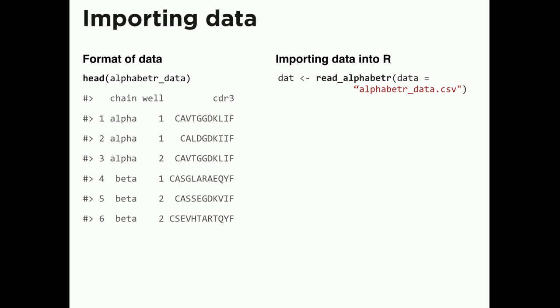What's the best way to describe this? The likelihood basically uses a binomial distribution, in that it's a question of whether that T cell is going to be sampled in the well or not. And there are some extra terms looking at experimental error. Basically, there's information in how often a T cell was sampled and in how many wells, and then we use that to infer what its frequency is.